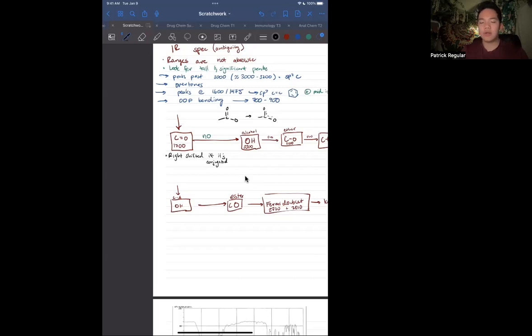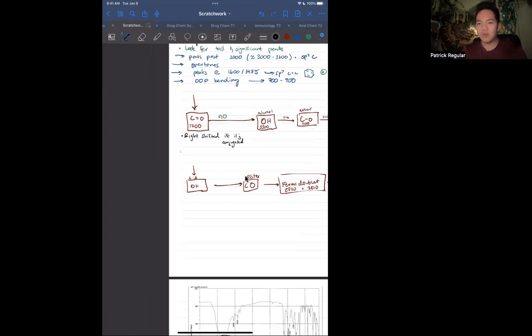That double bond, that carbonyl carbon that has the normal 1700 stretch, has a little bit of C single bond O character, so it's going to right-shift a little bit. Some other notes: this is going to be a relatively unique, tall peak. It's pretty definitive. And again, these numbers aren't absolute. You're going to be looking for 1650 to 1750, anywhere within that range. And if you find something even outside of this range I gave you, consider your options.